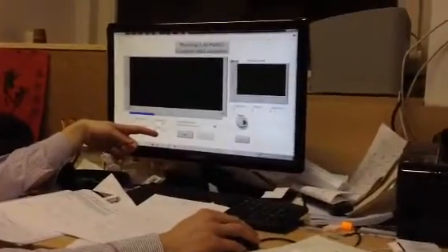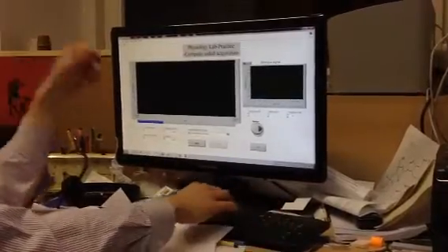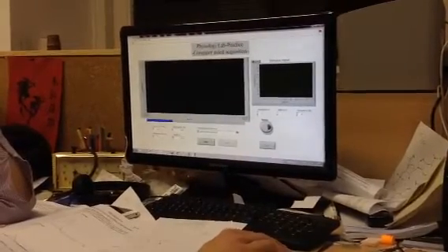So you set the sampling rate to 100, the length to 1200. You change only the end of this file name, for example, the measurement to something specific, like exam, date, and your name. This is what you don't have to use.